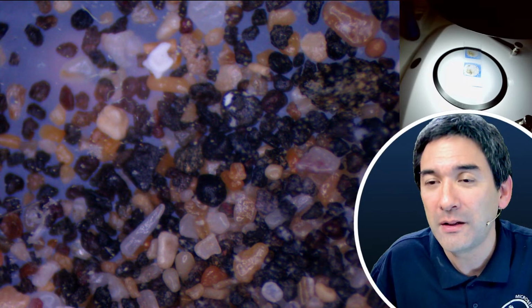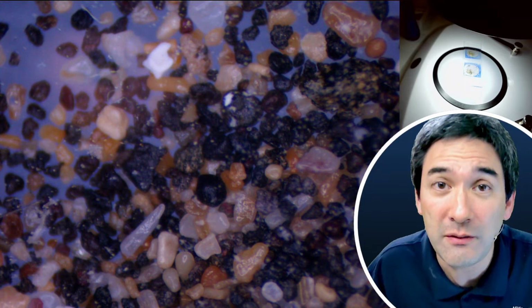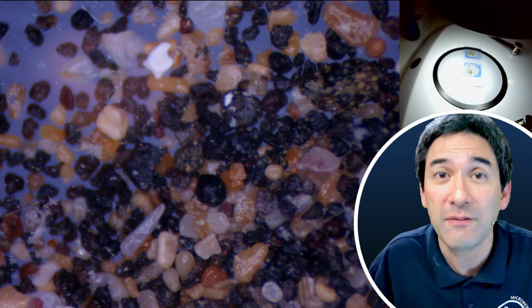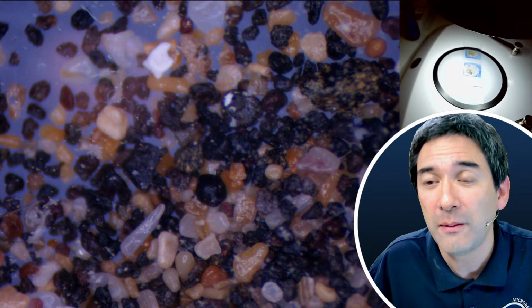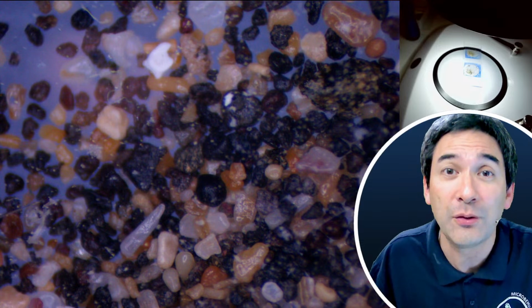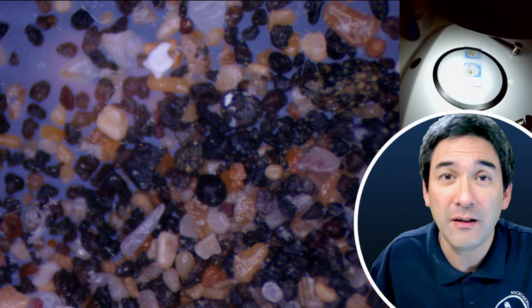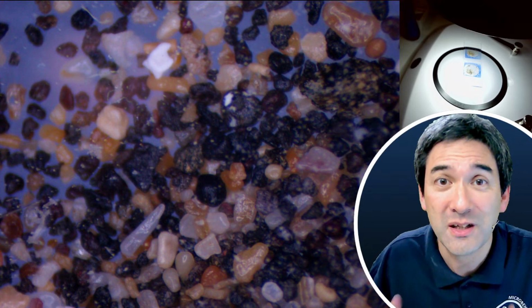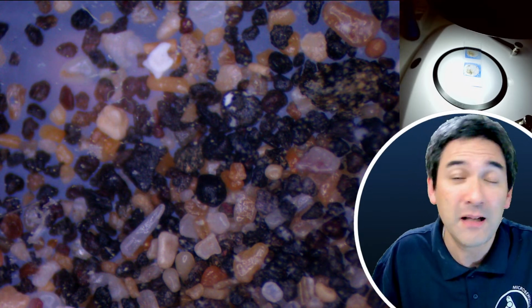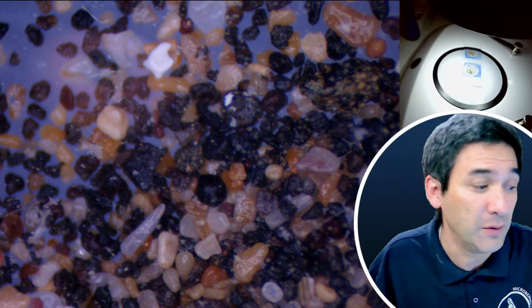However, I have to be honest with you, I am not even doing that. I'm not even disinfecting my slides, because if you have pond water organisms and you're not enriching those organisms, and the bacterial count is low because it's still fresh pond water, then I'm not worried so much, because this is a pond in any case where I'm swimming.